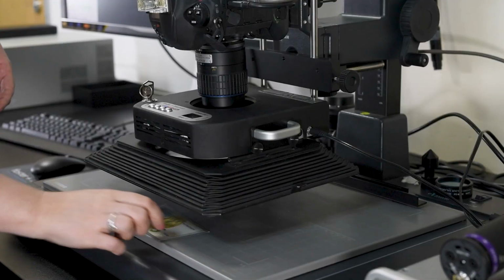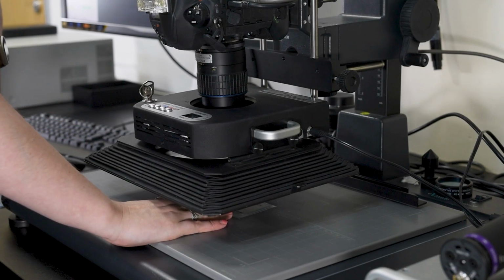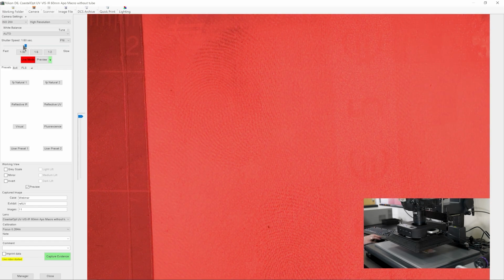And all we're simply going to do is we will place our banknote under our infrared light source. And what you actually see on the screen is all of that pattern has disappeared. We might have some security feature here in the banknote where we can see the 5 and the euro marks. There's also serial number as well. But actually in the areas where the fingerprint is visible, that area of the pattern has disappeared.